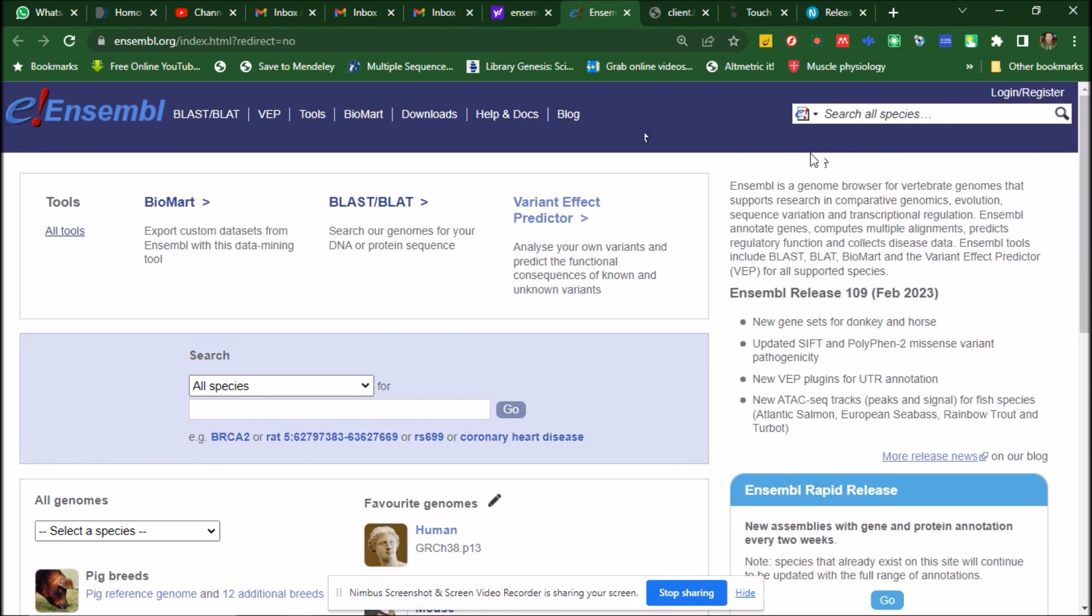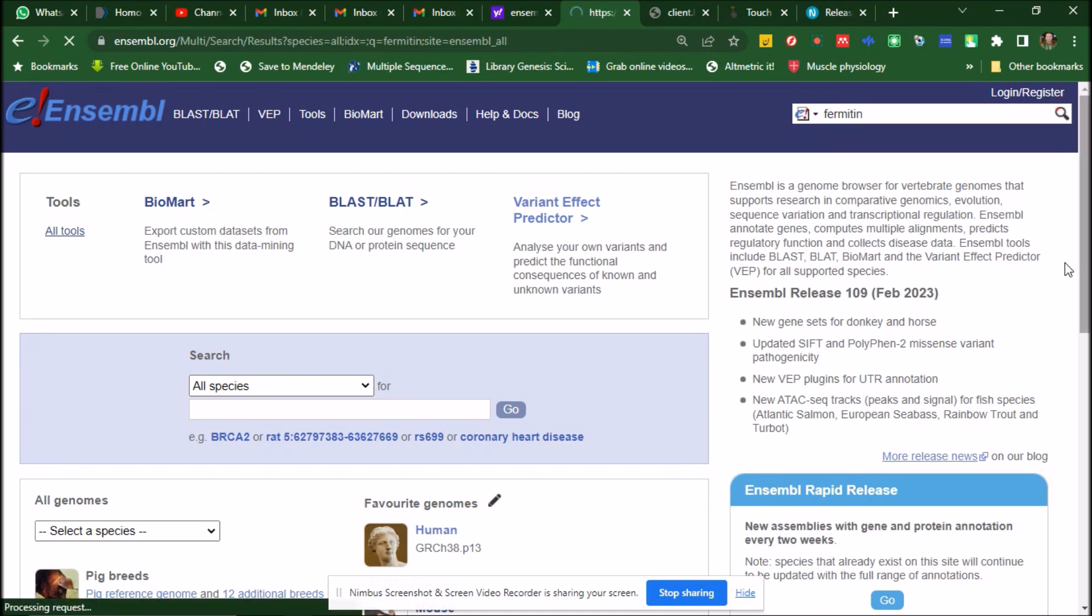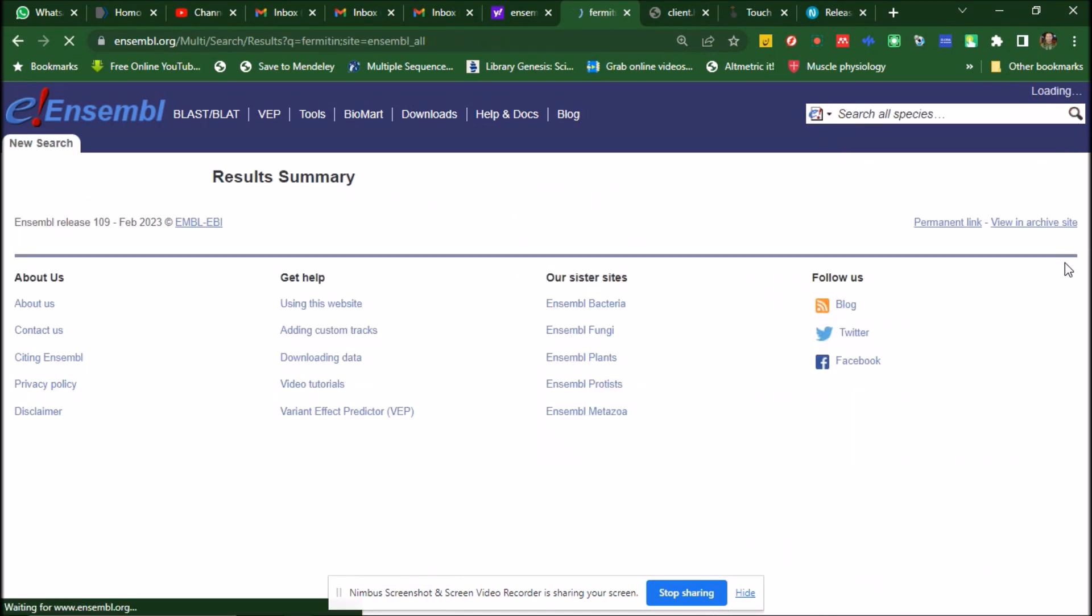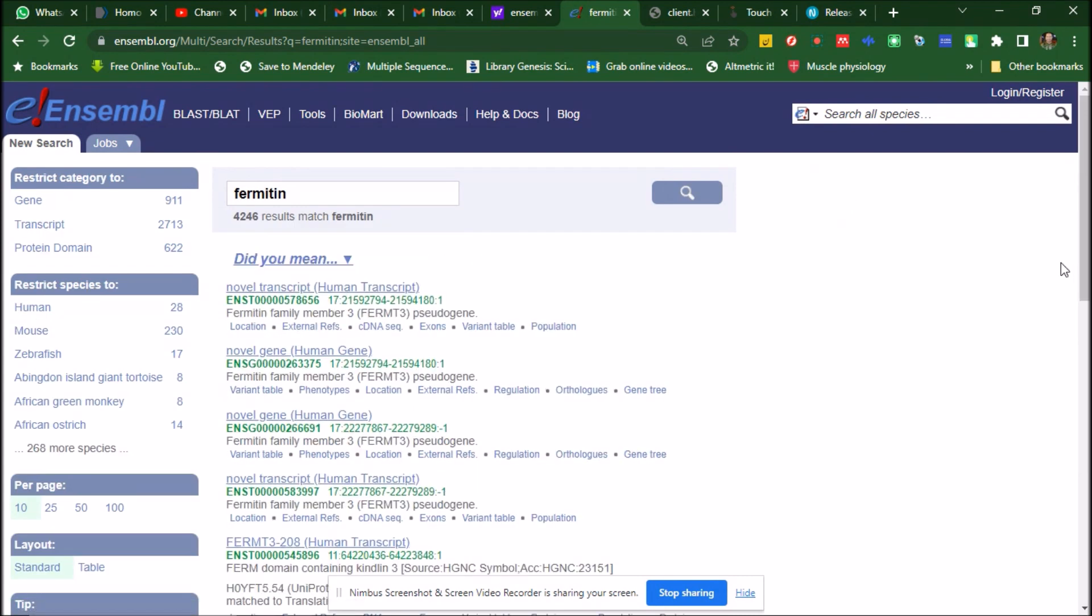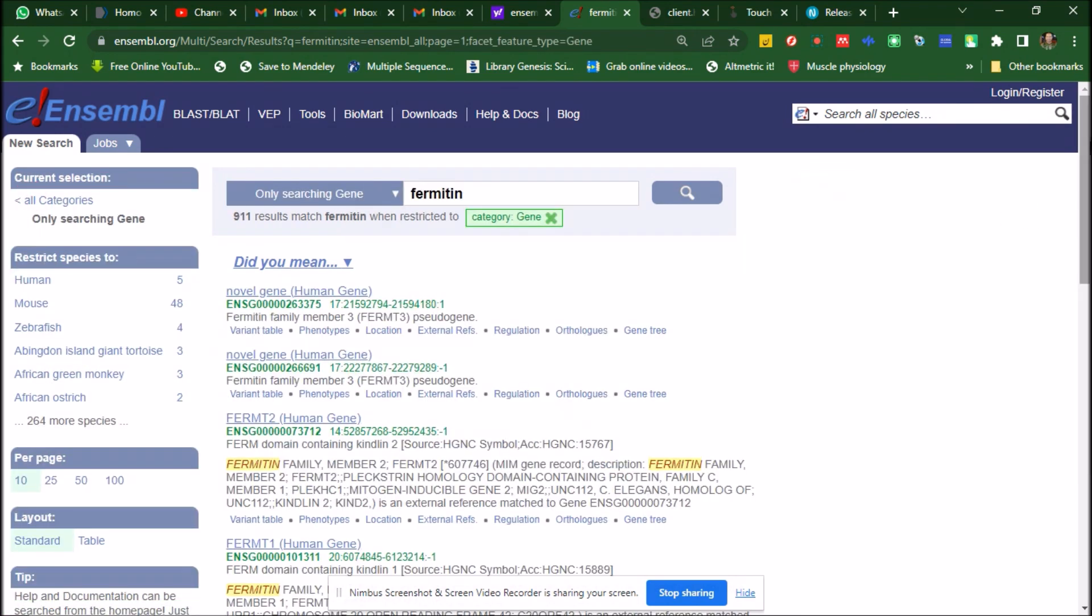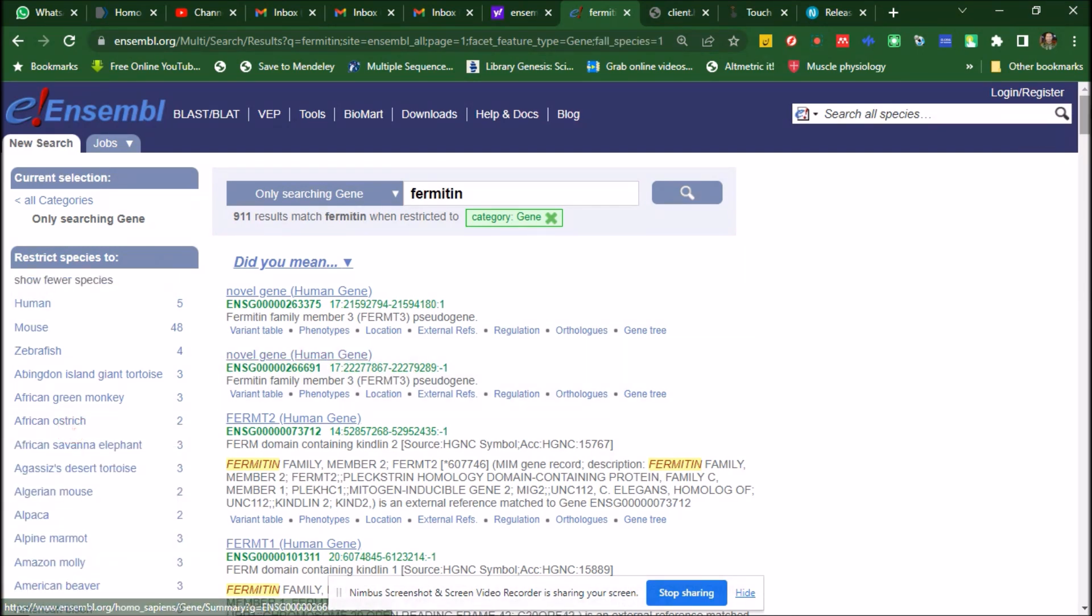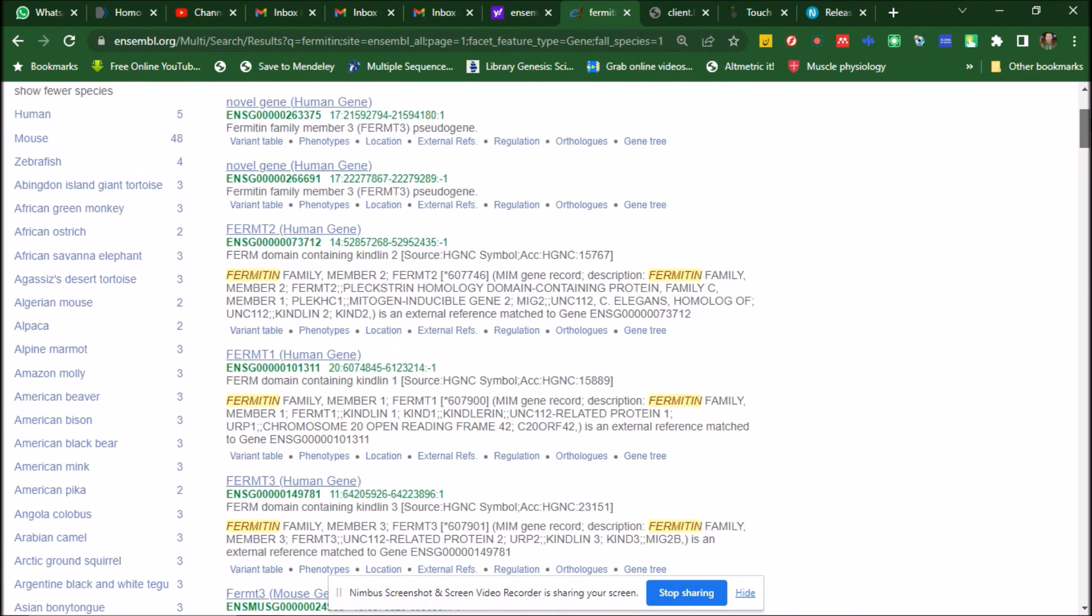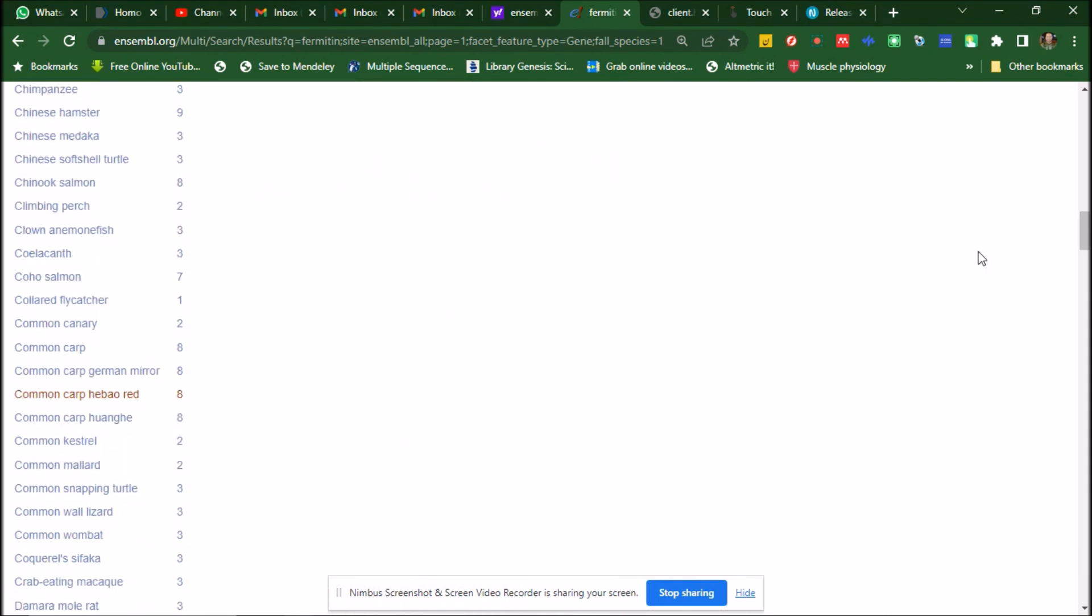let's say our gene of interest is FERMT2. So we go here, put the gene, and our species, let's say we want human. So we go for the human here, and you can find it like this, control F and put here, and this is FERMT2 unique.